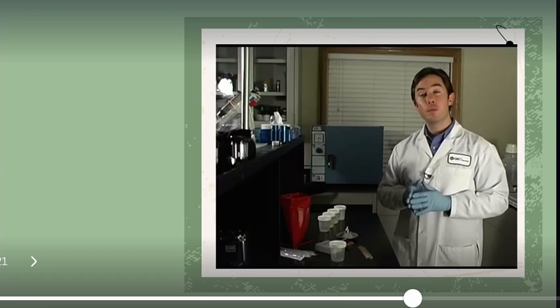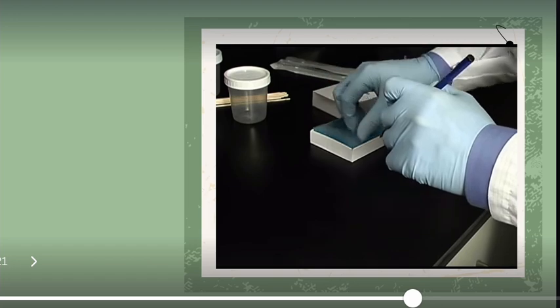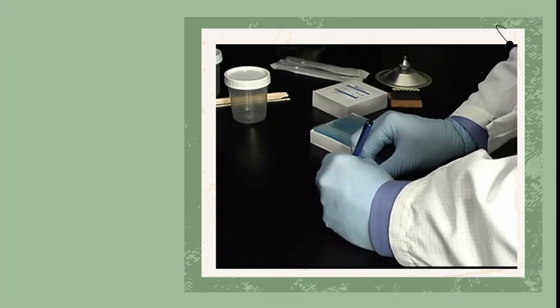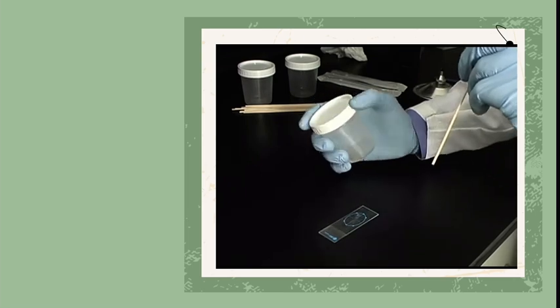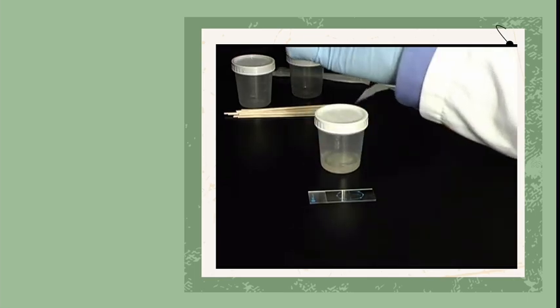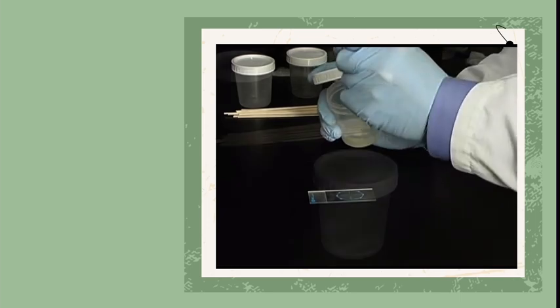Preparing a direct smear is a basic step in the laboratory detection of AFB. Prior to smear preparation, choose a new SureFocus slide that is clean and unscratched. Properly label the slide with the patient ID number, as dictated by your laboratory protocol. Once the pulmonary sample has been collected, use a wooden applicator stick to remove a small portion of the mucoid specimen. If the specimen is watery, use a transfer pipette instead, selecting the thicker particles in the specimen, as this is more likely to produce a positive result.